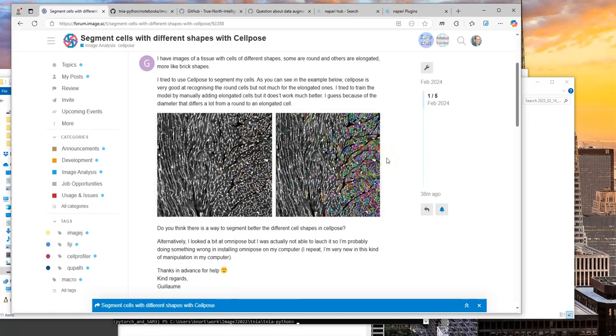And as is typical with Cellpose pre-trained models, Cellpose models are very good at detecting structure if it's all at the same scale, and can be adjusted for different scales by adjusting the diameter parameter. But sometimes it can be tricky if you have structure in the same image at different scales. So in this case, the long cells and the roundish cells.